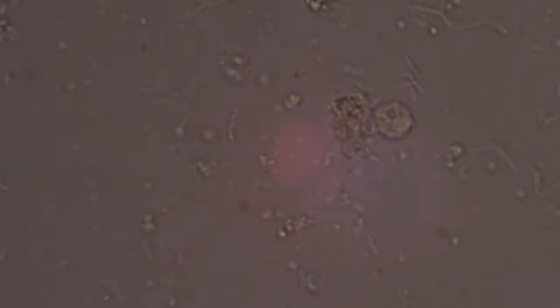I'm seeing some cell structures in here as well. I'm not sure if those are dead white blood cells or what. Pretty small, actually. But there's lots of spherical cells in here. Little Death Stars, basically. See that little... Looks like the nucleus there. A little shape toward the center.